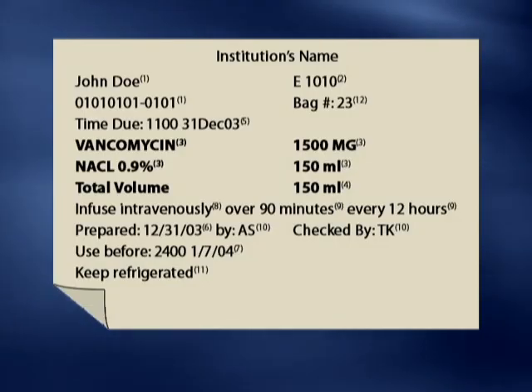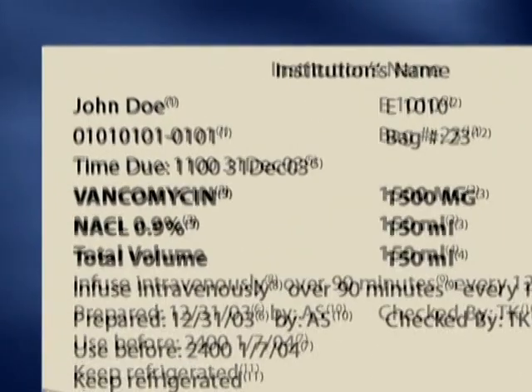In addition to these minimum labeling standards, patient-specific compounded sterile preparations have additional requirements when used in institutional and/or home care settings. Accurate labels not only help staff efficiently deliver preparations, but also supply needed information to staff or patients and caregivers to safely administer the correct medication to the patient.